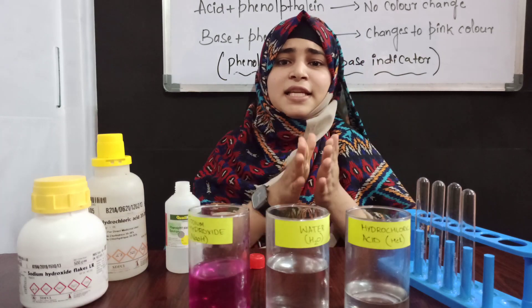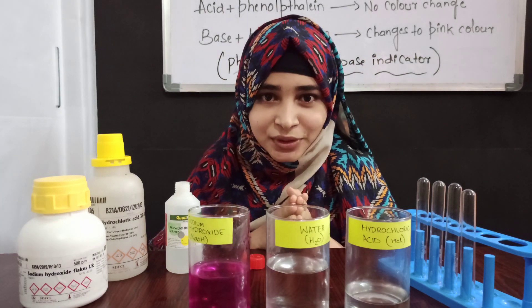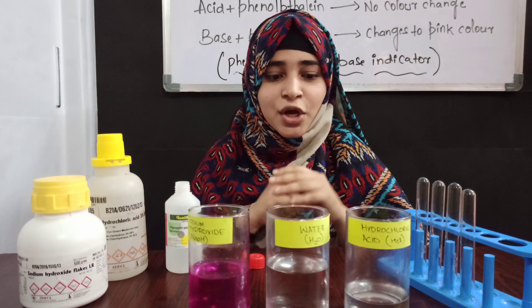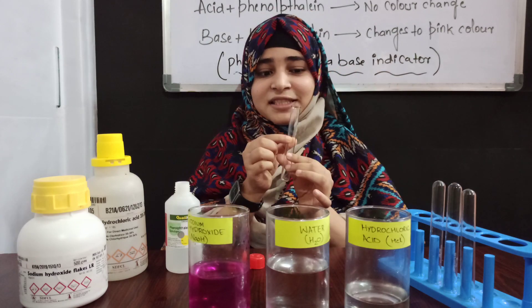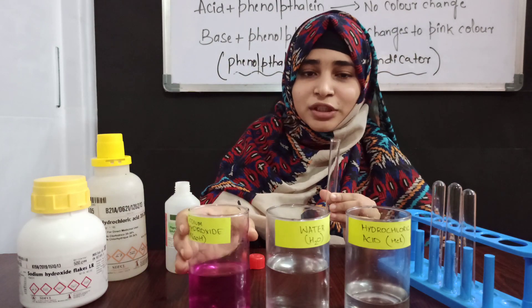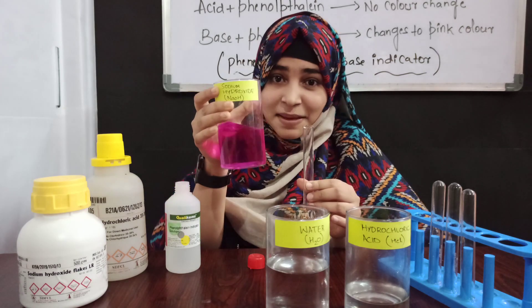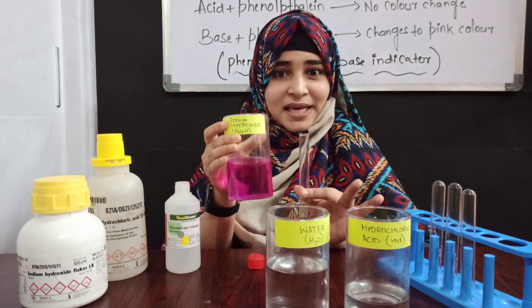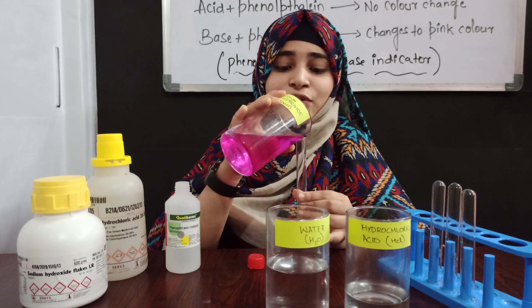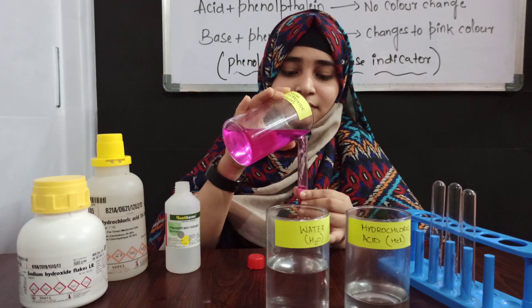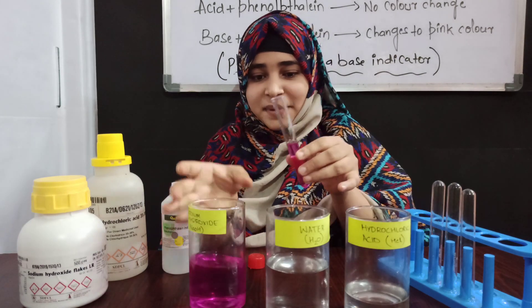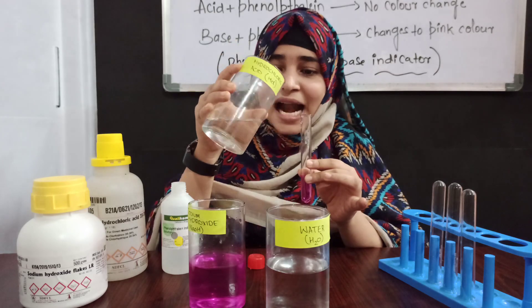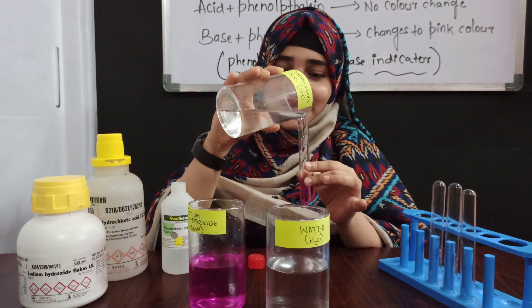Now let us come to the neutralization reaction. As we studied, neutralization reaction means the reaction between acid and base. Take a test tube and take some amount of the basic solution — sodium hydroxide. If I add the phenolphthalein indicator it remains the basic solution. Now this is the base, and if I add acid into the base, the neutralization reaction occurs.